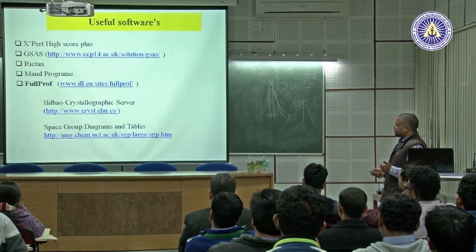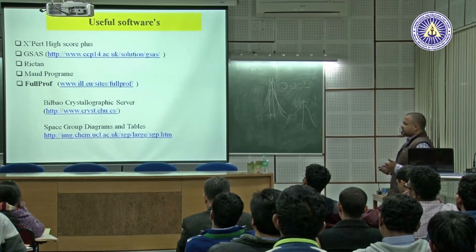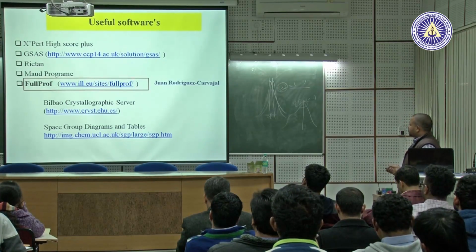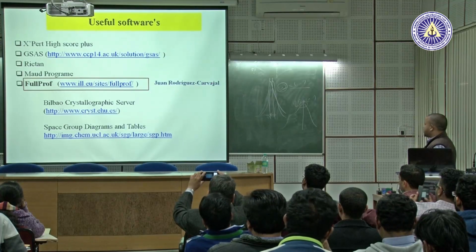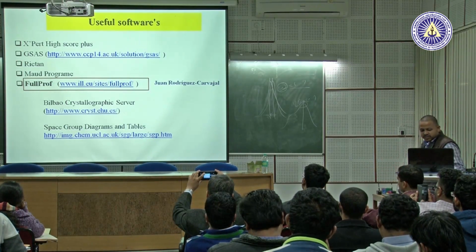Rietan is also a paid software. Then there are Mod program and FullProf. FullProf is a free software, and it came into existence with Professor J. R. Carvajal, a French scientist and professor, you can say.